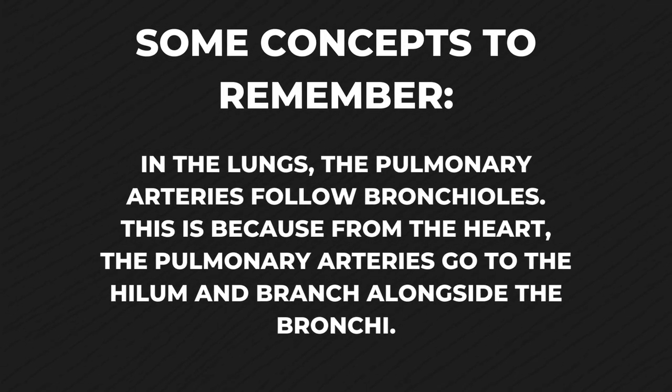In the lungs, the pulmonary arteries follow bronchioles. This is because from the heart, the pulmonary arteries go to the hilum and branch alongside the bronchi.